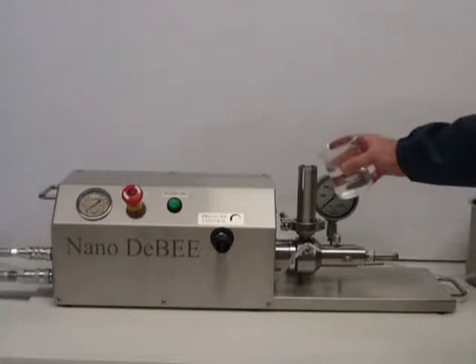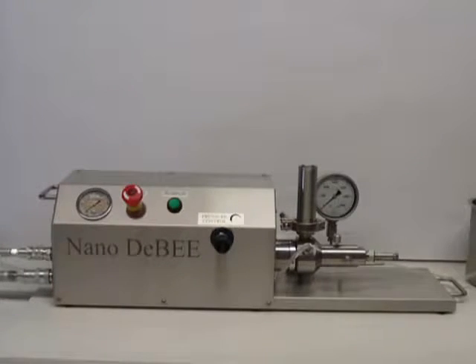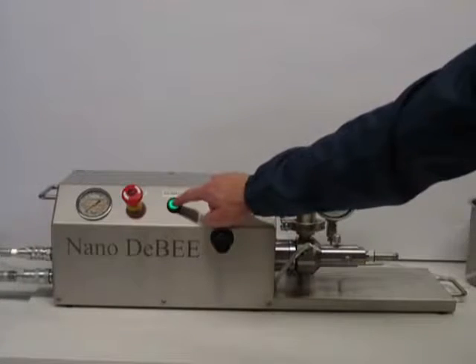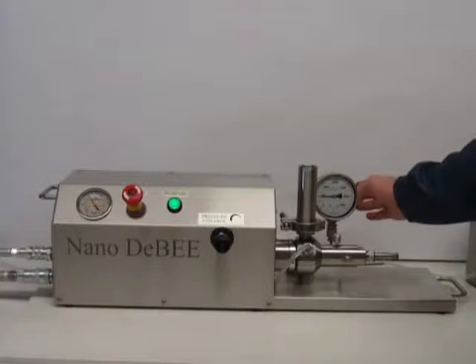To run the NanoDB, we add product to the inlet reservoir. Then we turn the pump on. We can read the process pressure on the gauge.